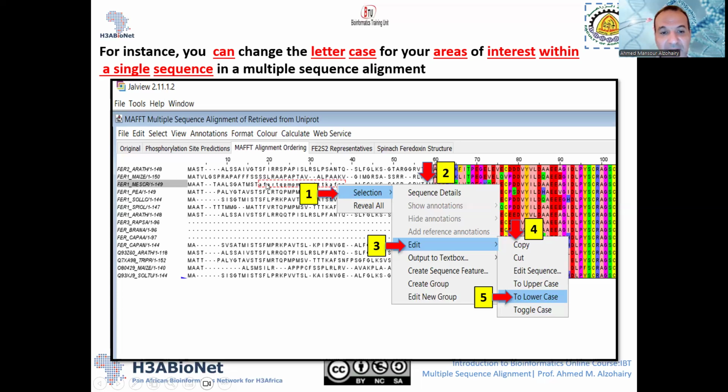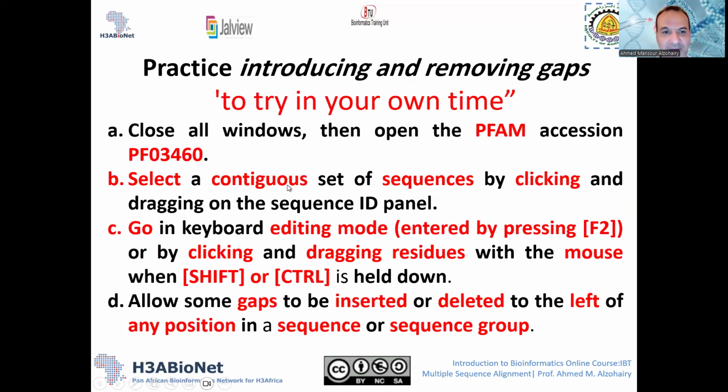If you look at this area outlined by the red line, all are small letters; there are no capital letters. So the letter case has changed, making this region a little different from the others. I can easily figure out that it is different, so it should mean something to me.